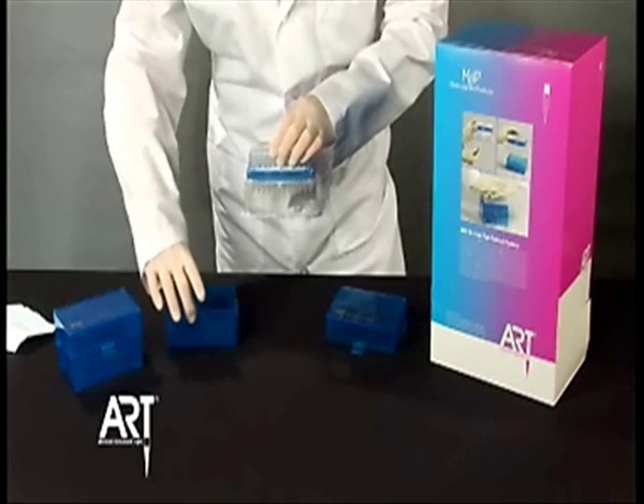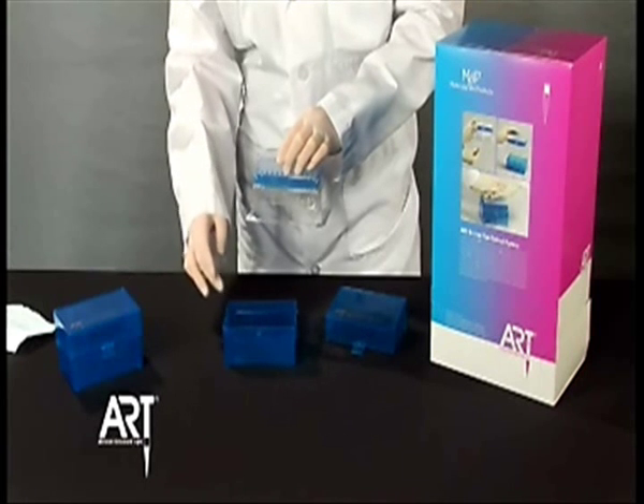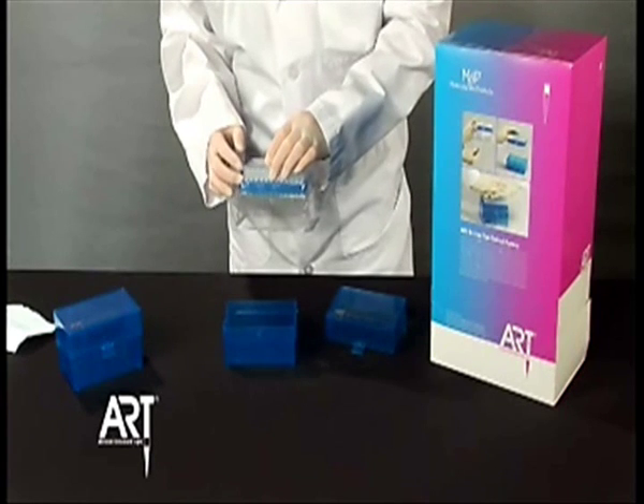Align the front of the blister tub with the front of the newly designed Art Hinge Rack. Remember, each component of the new Hinge Rack has a molded-in recycling logo, which allows for easy recycling. The blister tub is also made from recycled plastic.